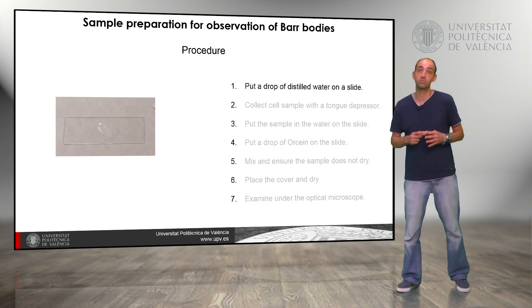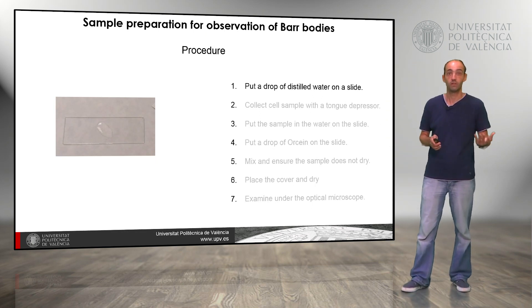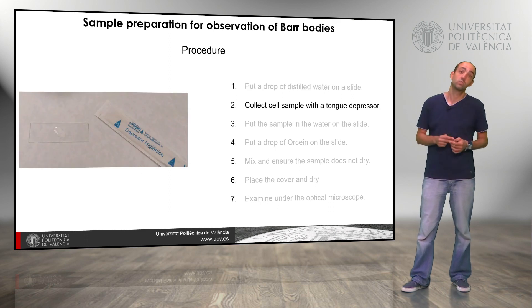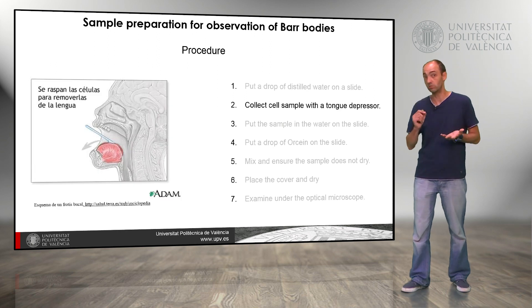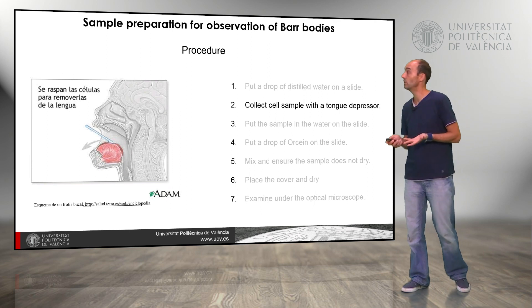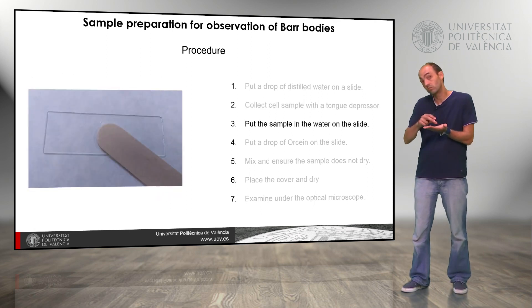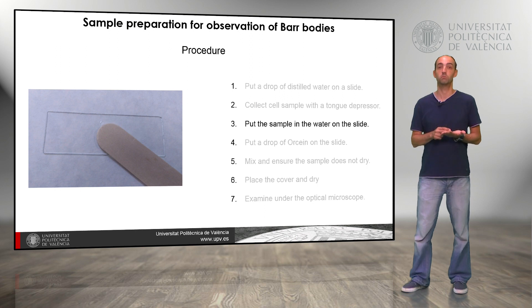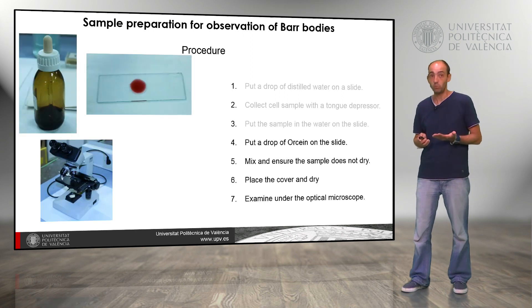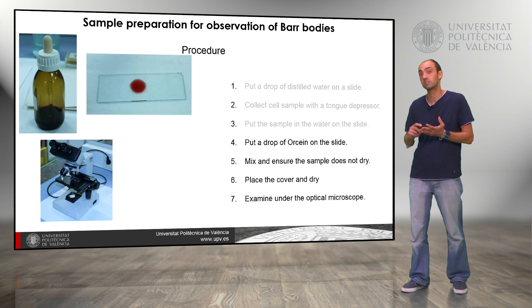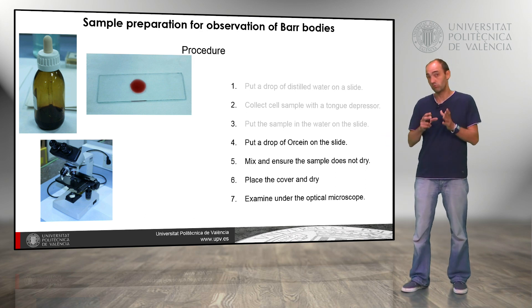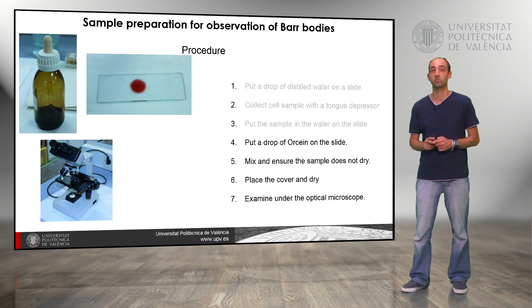The first step is to put a drop of distilled water on a slide. Then we collect the samples using a tongue depressor, which is quite useful for this purpose. We can take those samples from the tongue or from the inner part of the cheek. We take the samples with care and place them on the drop of water on the slide. Then we stain those samples using orcein, mixing well and ensuring that the sample doesn't dry — we have to check periodically. We stain the sample for around 20 minutes.